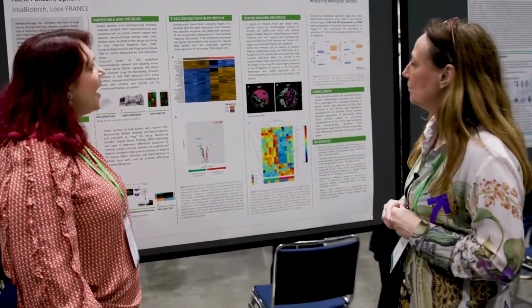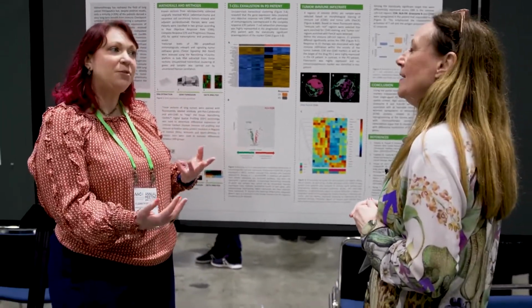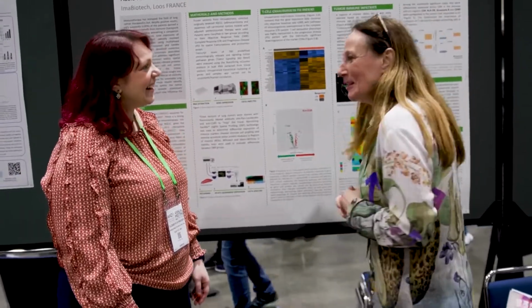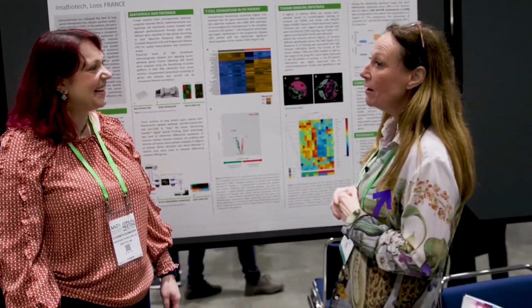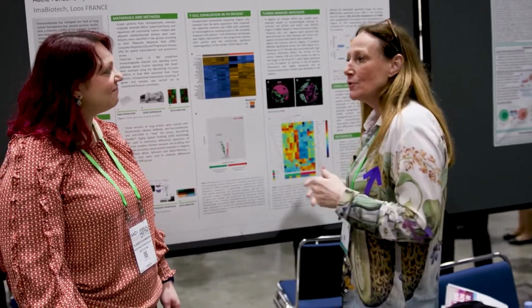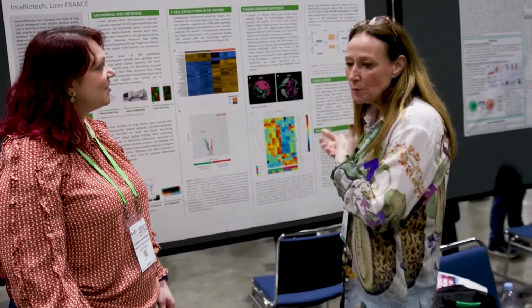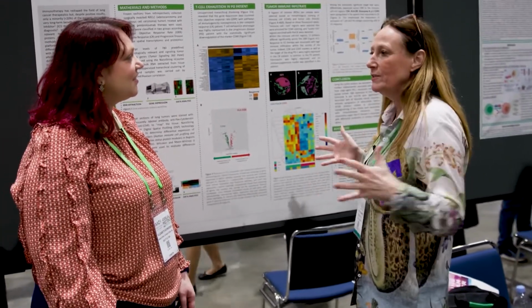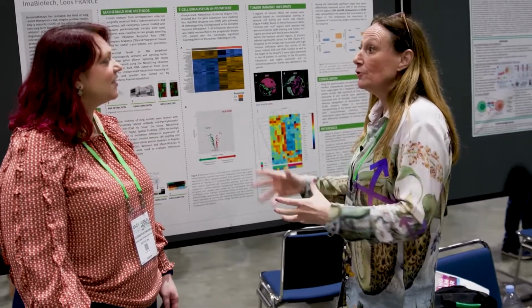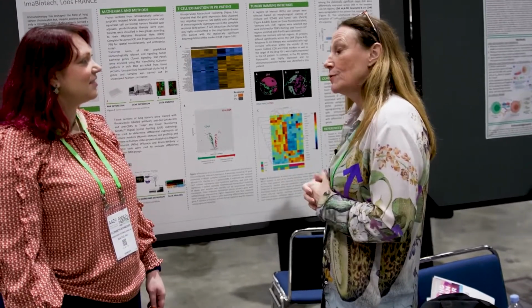I see. So have you thought about going beyond protein and doing the whole transcriptome? Yes, this is next, and this is my next poster, which is not for today. Obviously, we have a lot of requests at my biotech for the WTA, the unbiased transcriptomic assay, just because people want to browse completely on the tissue section, on the different regions of interest, what could be, in a completely unbiased way, the transcription signature.